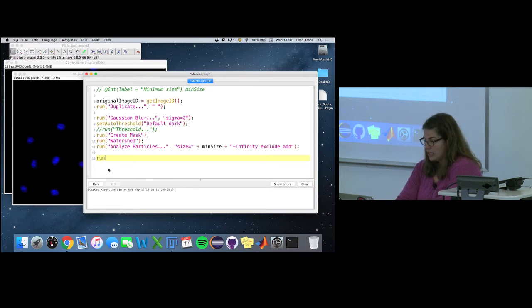So we're going to actually clear results. This is just in case there were previous measurements in the results window. You just want to empty it, make sure it's empty of anything before we measure, so then you're just getting the measurement from that one particular call.